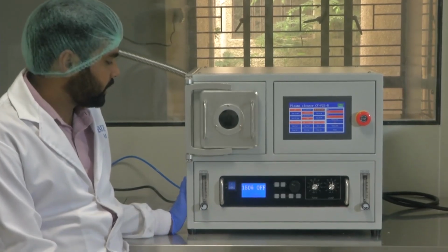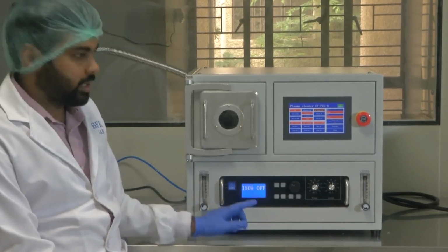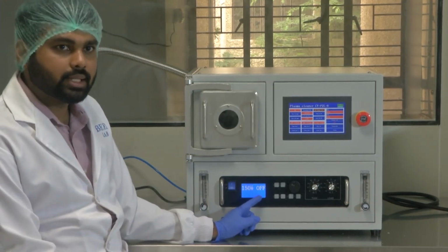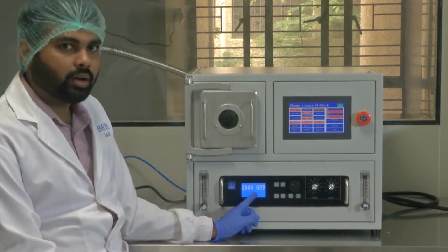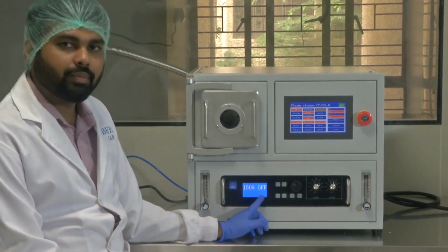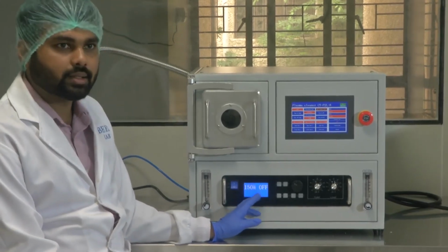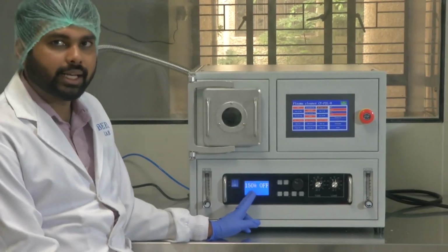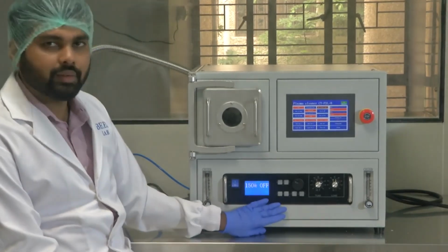That sound you can see, and you can see a display on the plasma control. That is 150 watt forward power and the RF is off. That is the overall status. 150 forward power and off. That is the maximum RF power that it can deliver, and off state. Right now we are not touching this.